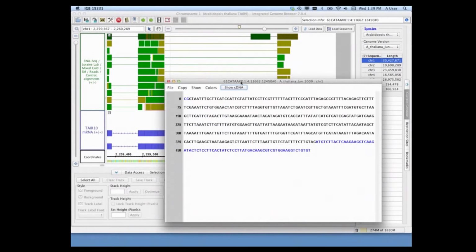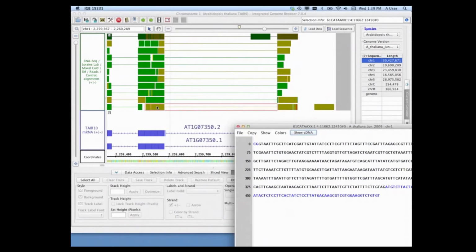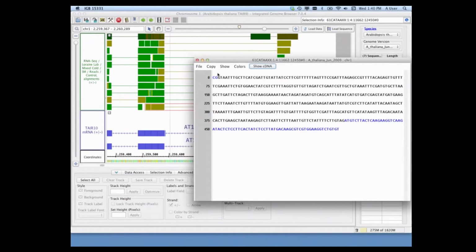now notice we're on the minus strand. So the little tail is what's listed first. And this longer section is what's listed down here. But what this is actually showing me is the genomic DNA that this maps to. This is not the sequence of the read.